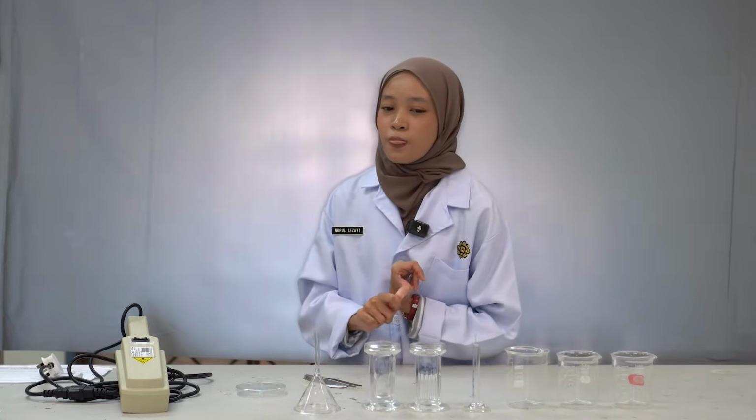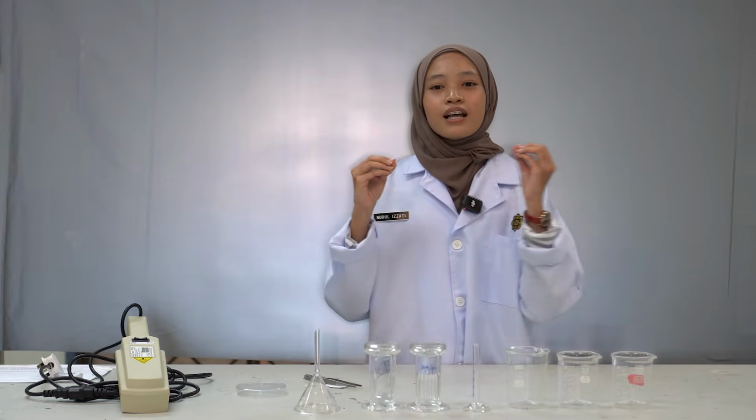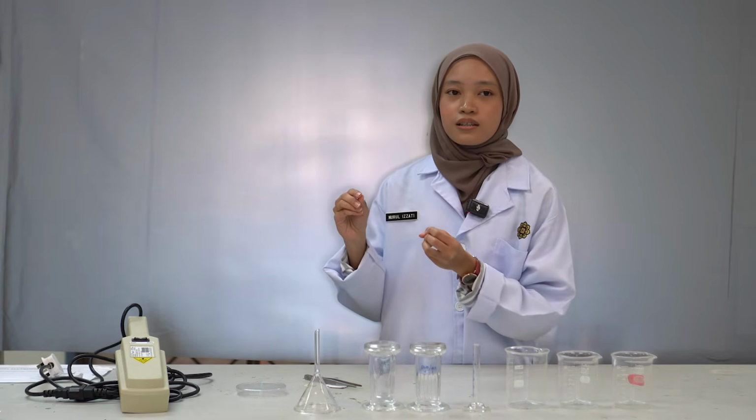So to conclude, TLC is not just an academic exercise but is also important in purifying medication, protecting food safety, and confirming clinical analysis. Since TLC is simple, cost-effective, and fast in producing results, it is mainly a method that is used in industry.